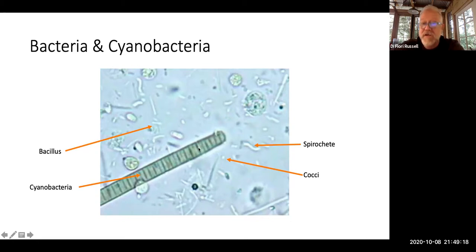You can see compared to the other bacterial cells, some are colonial. The cyanobacteria also move. They can glide through the water. And so they make kind of a unique contribution. Sometimes they are the primary producer of choice in systems. In some, especially those that are kind of semi-anoxic, you may have all cyanobacteria in there, and they may be super abundant and be the primary producers.